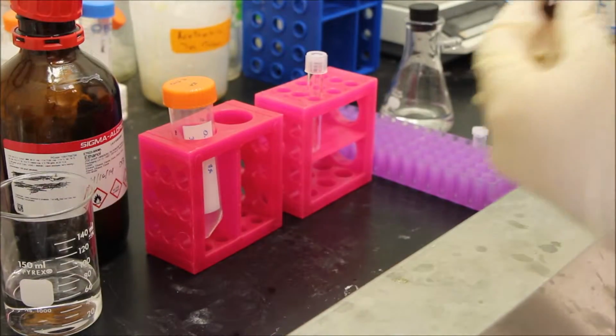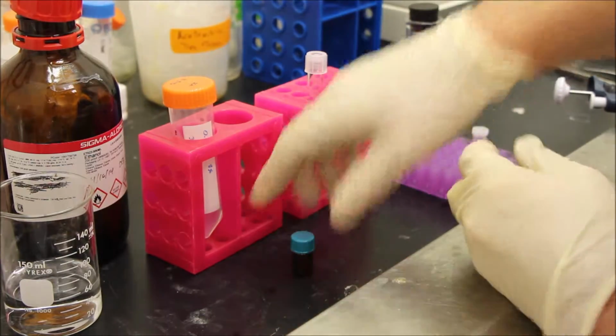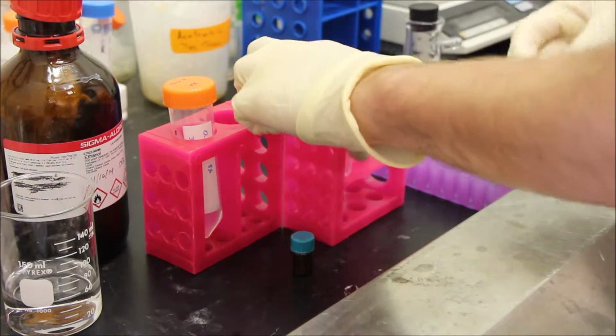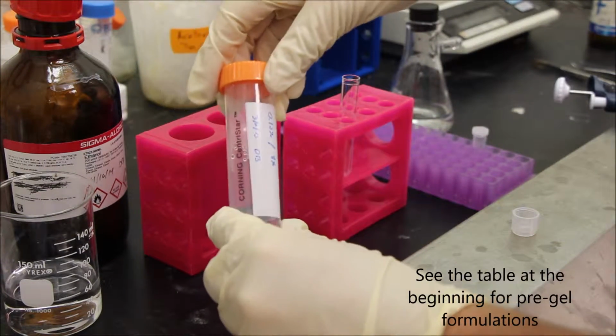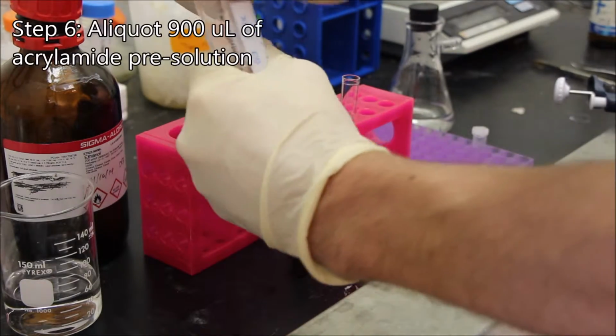Okay, so after 2 minutes of sonication, I don't know if you can see this, but there's no particulate left in there. Now to make the gel, I have this 5 ml tube here, and I have my pre-gel solution that I've previously formulated. And this has the acrylamide, the bisacrylamide at the proper concentrations.